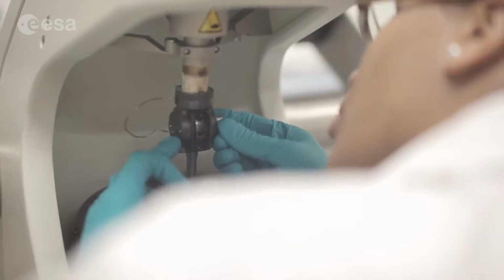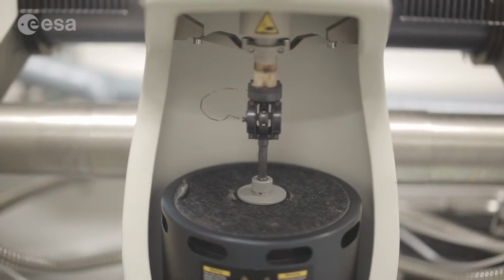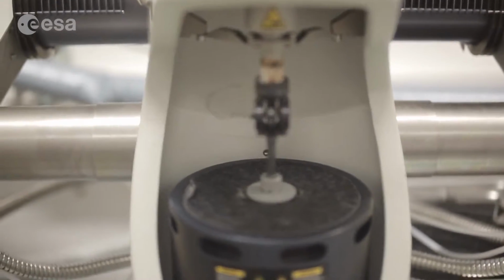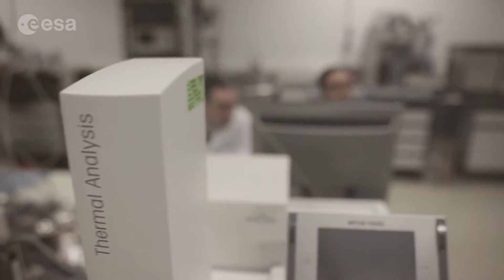And from that, we estimate the viscoelastic component of something called the modulus, which is really just stiffness. Because I'm sure you've all encountered this, a rubber at low temperature gets much more brittle. At 100 degrees C, it's probably a little bit more flexible. And what the DMA really does is measure those effects.